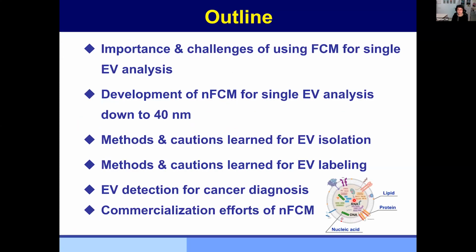So today's presentation will cover these 6 topics. First, I would like to talk about why it is important to use flow cytometry for single EV analysis and how difficult it is.